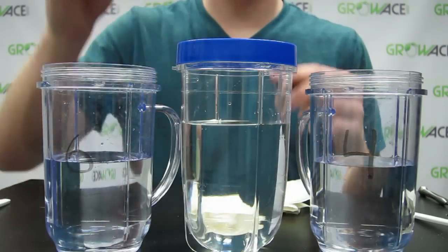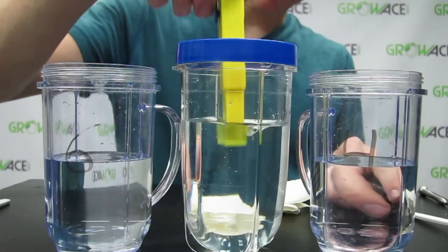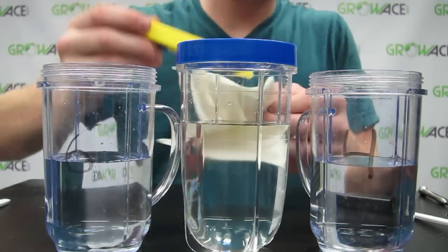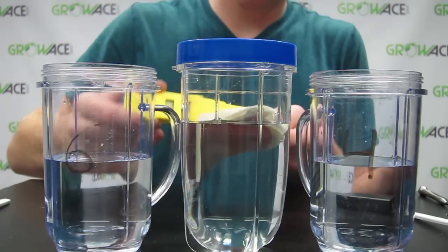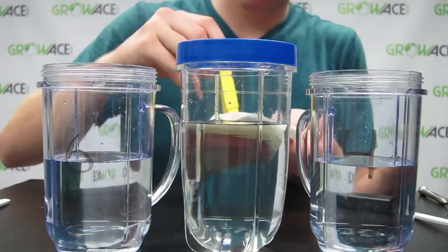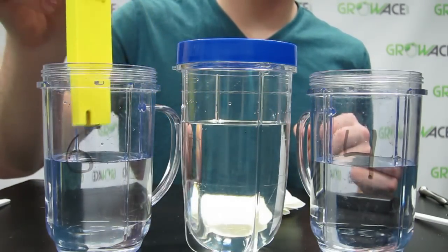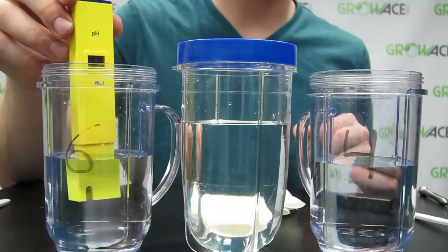Grab the pH meter, remove the cap, and gently rinse the electrode with the distilled water and dab it dry. Turn the meter on and dip into 6.86 pH solution. Wait for the reading to stabilize.